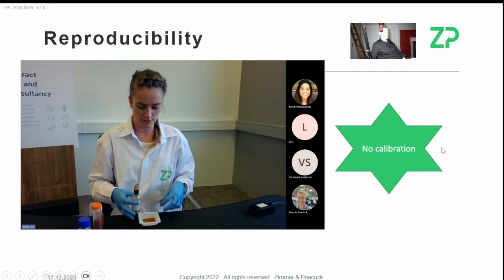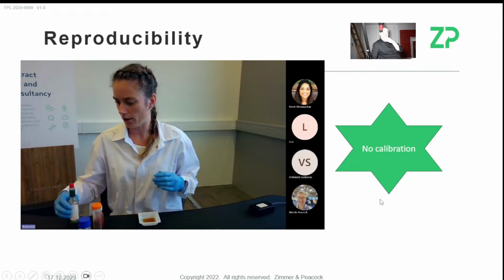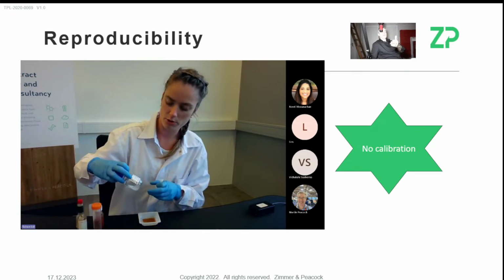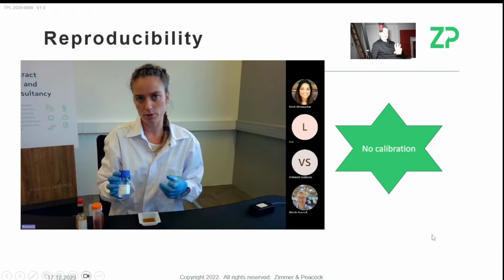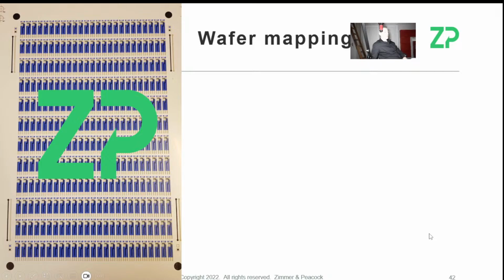So the fact that we have no calibration is really because of the reproducibility, either of our sensors when we're working with clients that are actually going to market, or of our screen printed electrodes. And the five that I've linked up above are pretty good because we use them a lot. We do something called wafer mapping. I think I'm the only person who uses this term because I've spent some time in the electronics industry.